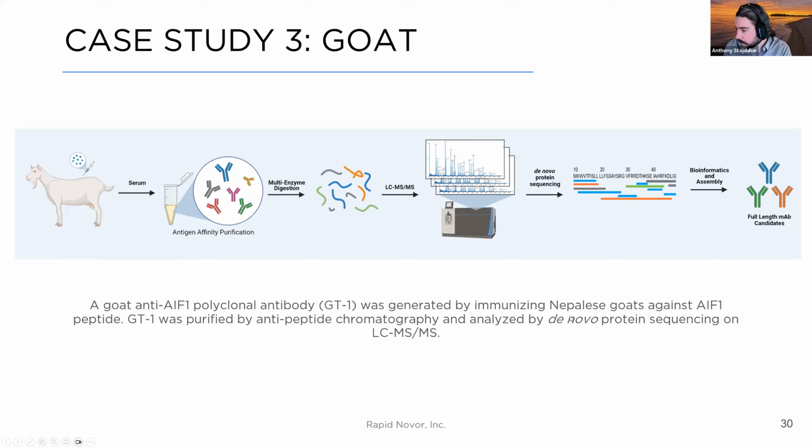and this antigen was challenging to just generate an antibody response against. So we were able to work with this. This is actually from a partner of ours. They had injected their goat some time ago, many years ago actually. It had been repeatedly immunizing this goat with that peptide of interest in order to generate a fairly mature antibody response. I think it's really important to understand the context here as I show you in the next slide.